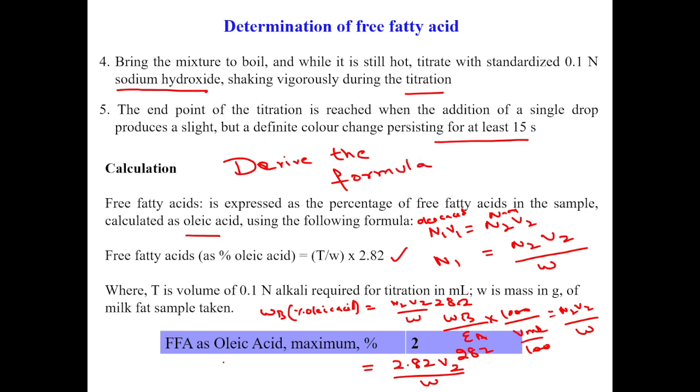Okay, now free fatty acid as per oleic acid, as per FSSAI, should not be more than 2%. The recent standard of FSSAI is that free fatty acid expressed as percentage oleic acid should not be more than 2%. Okay, so in this way we can determine the free fatty acid content in ghee.